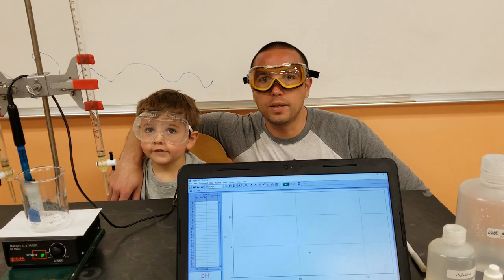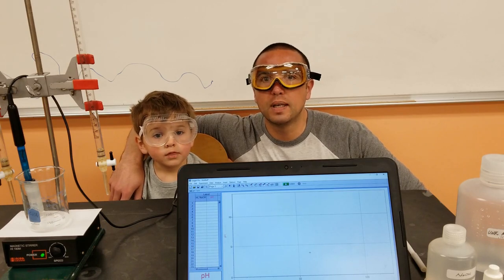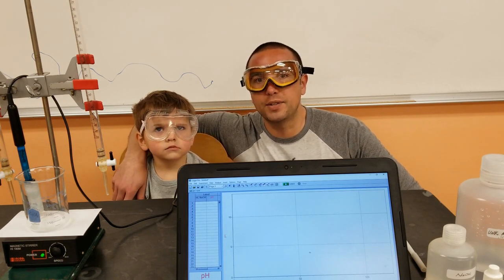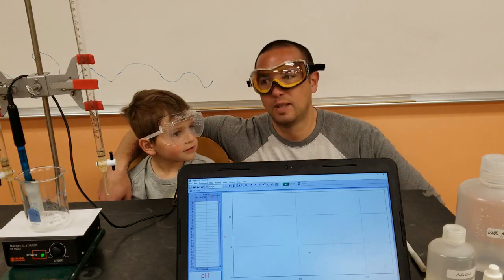Today we're doing another type of titration. This time we're going to be titrating an unknown solution of sulfuric acid, H2SO4, with a known concentration of sodium hydroxide. We'll also be graphing the pH so that you can all see what happens to the pH of something as you titrate it.